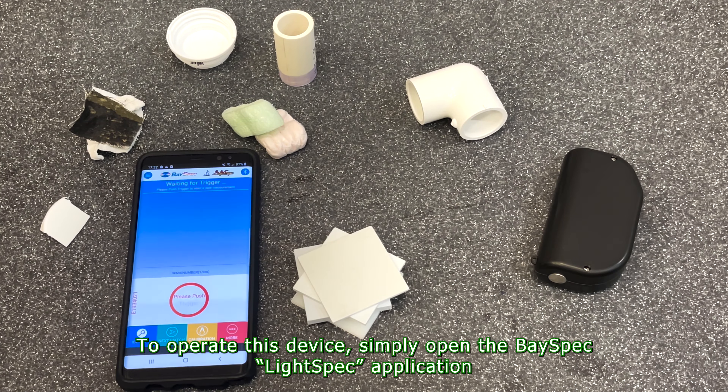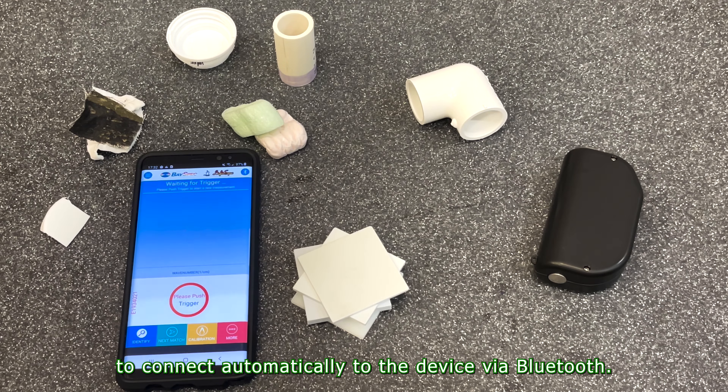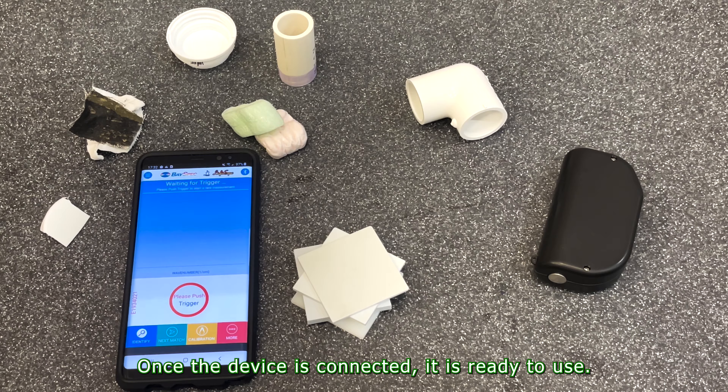To operate this device, simply open the BaySpec LightSpec application to connect automatically to the device via Bluetooth. Once the device is connected, the instrument is ready to use.